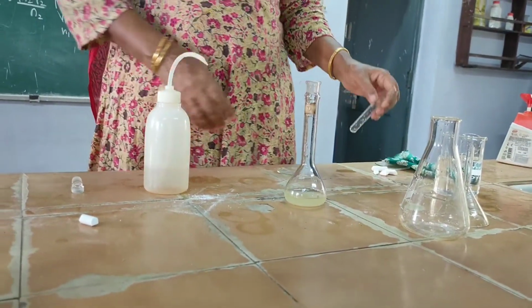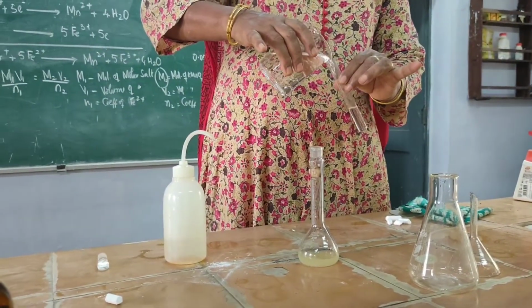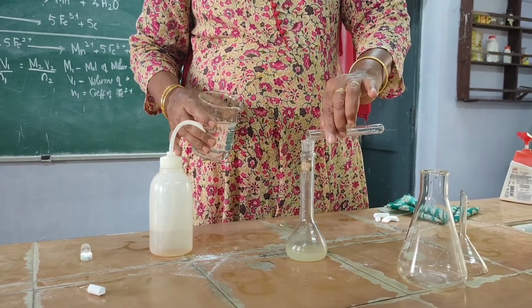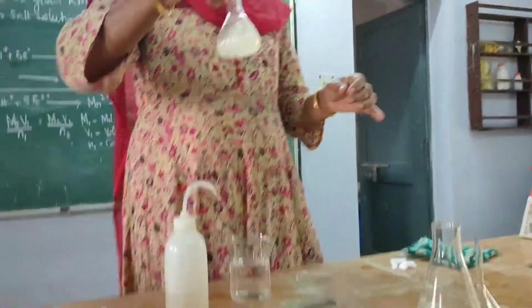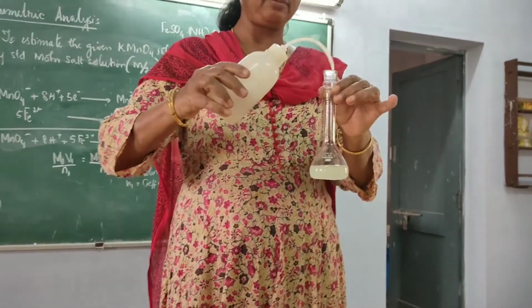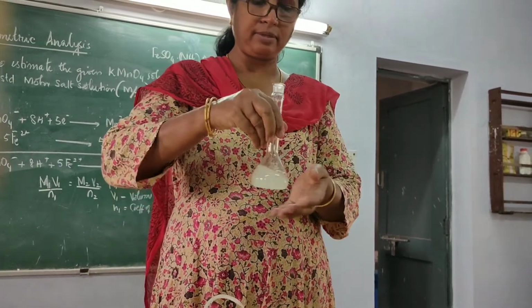Then what you have to do is take sulfuric acid and add it to prevent hydrolysis. Then add some more water and dissolve completely.